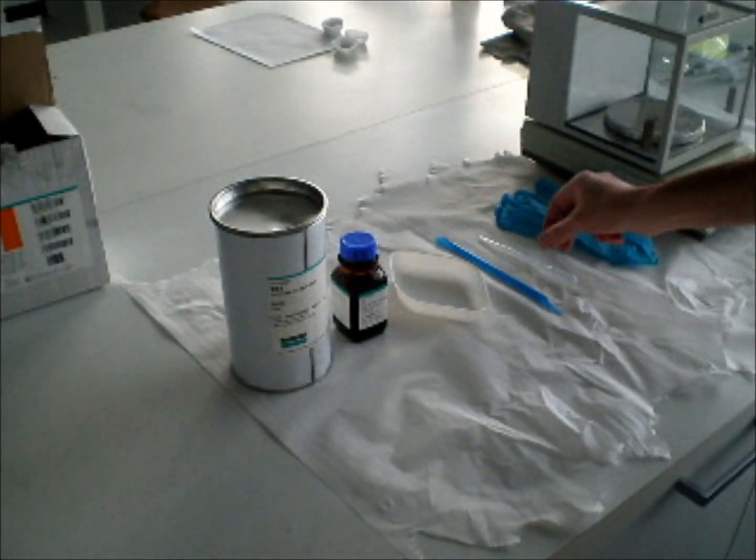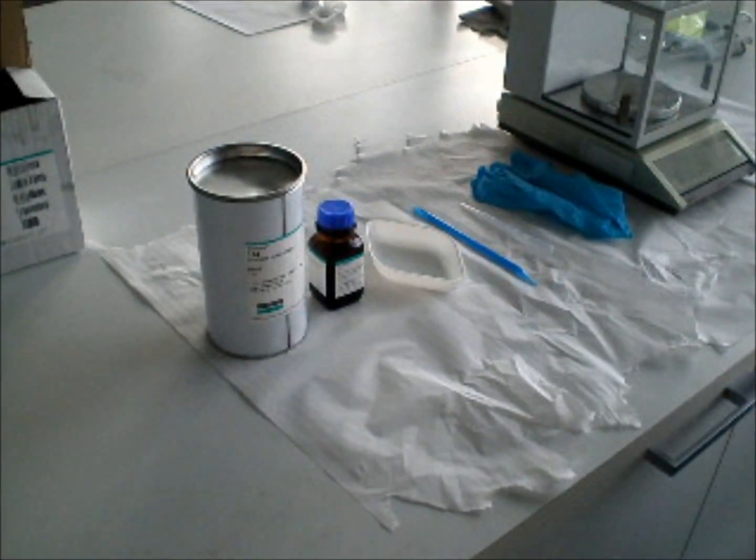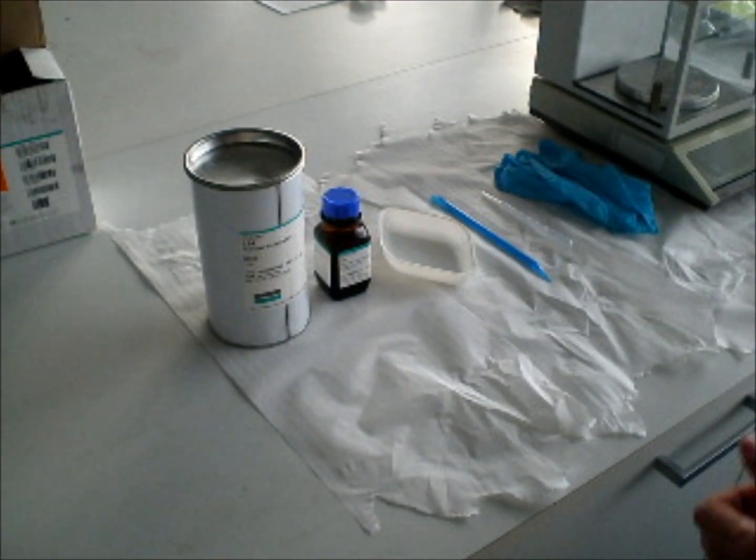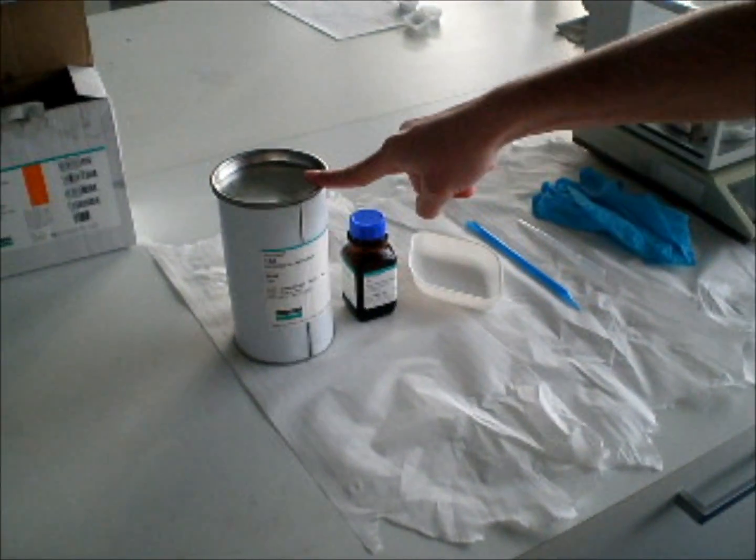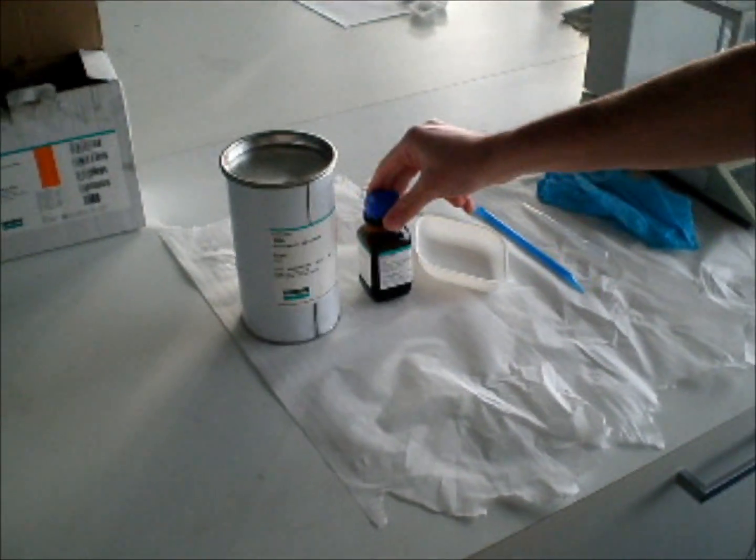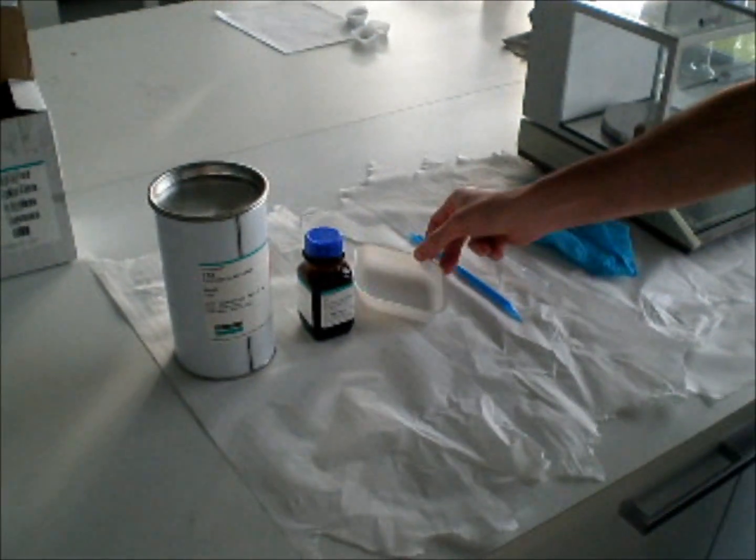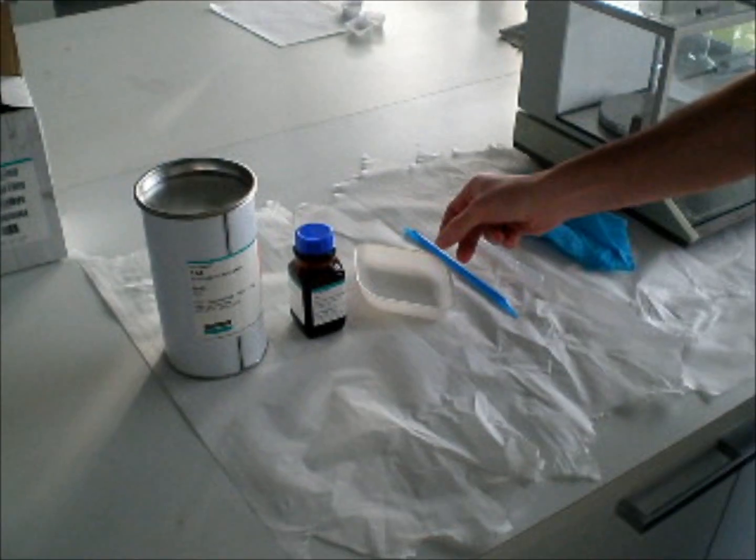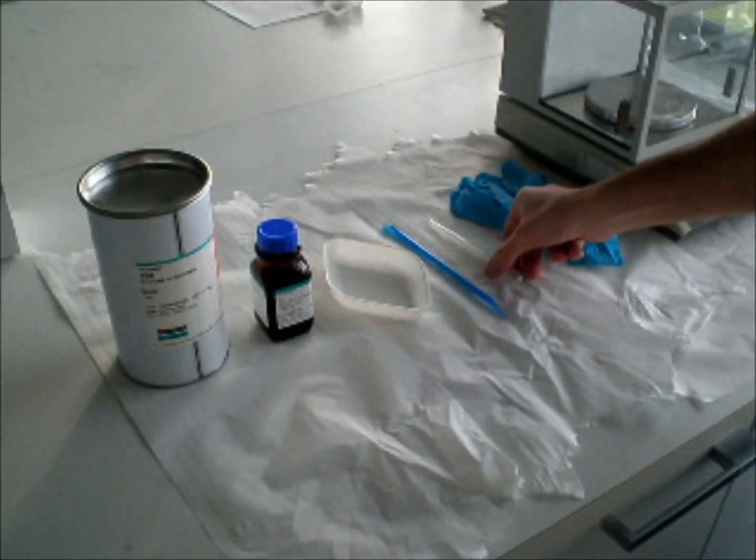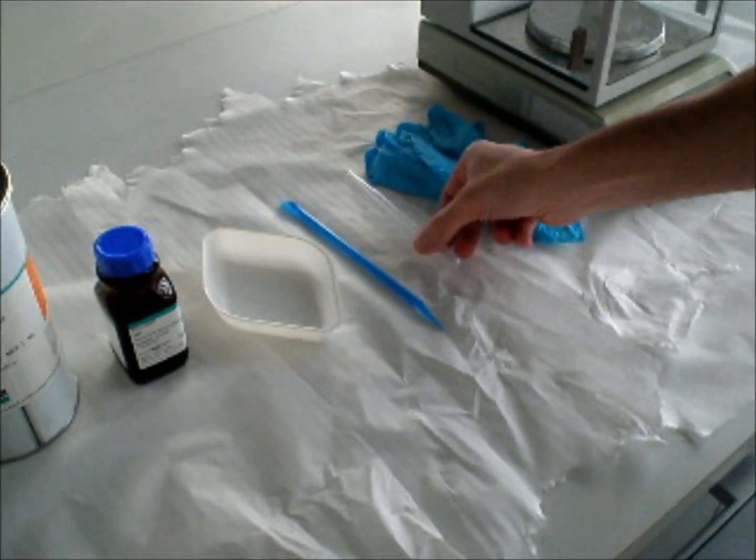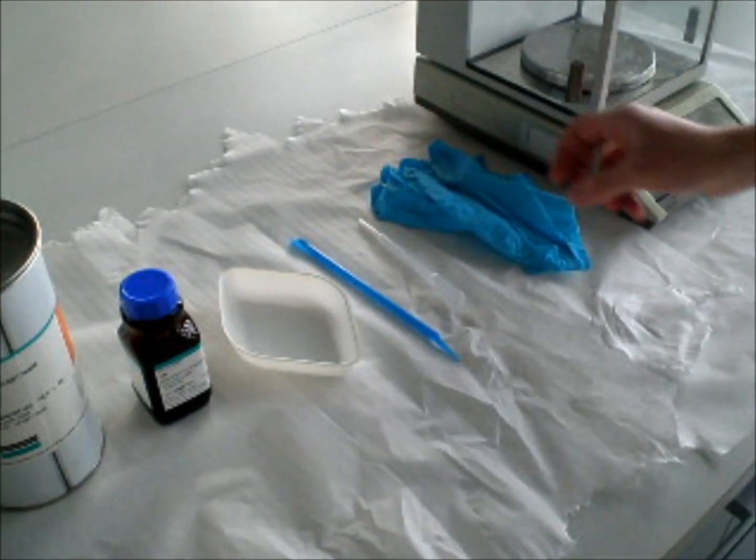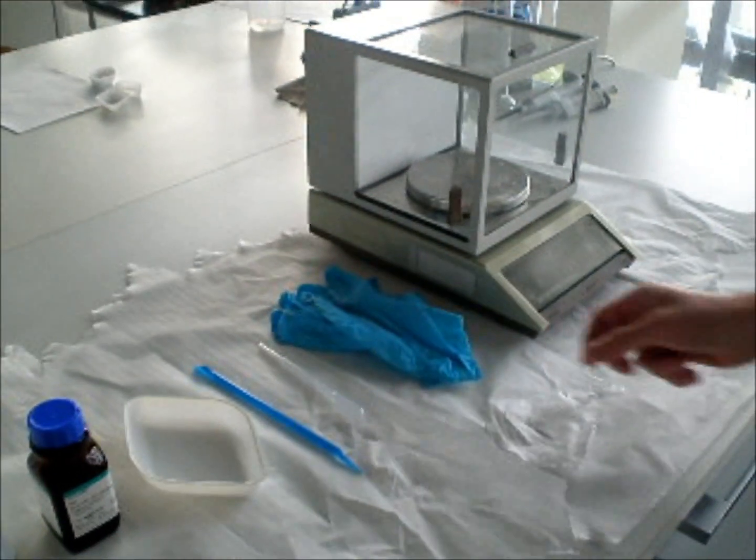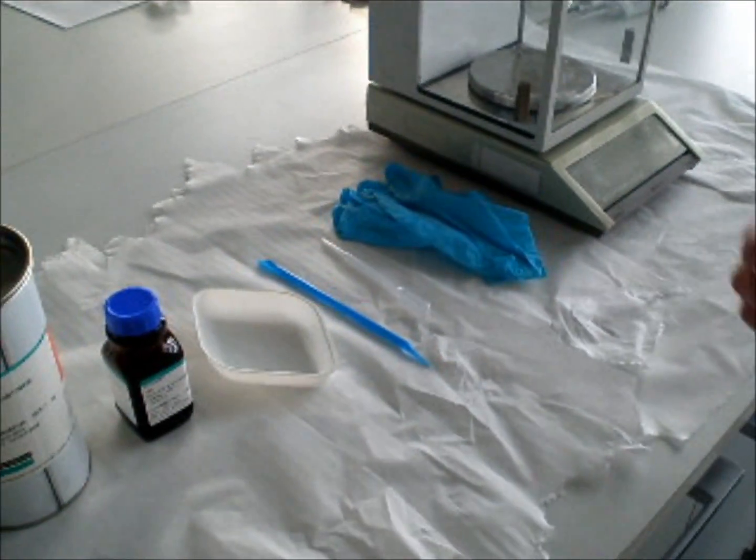Ok guys, today we have made silicone at the University of Southern Denmark in the Nano Lab. What we need for silicone is silicone elastomer, hardener, the plate we will use to mix it, and of course gloves. So let's start.